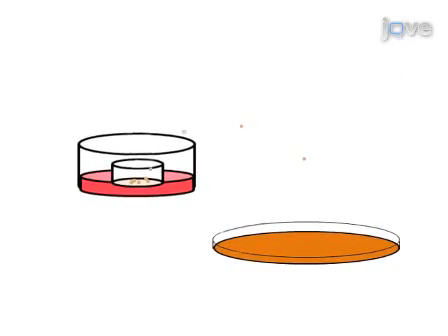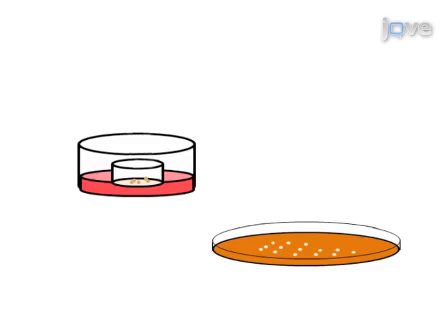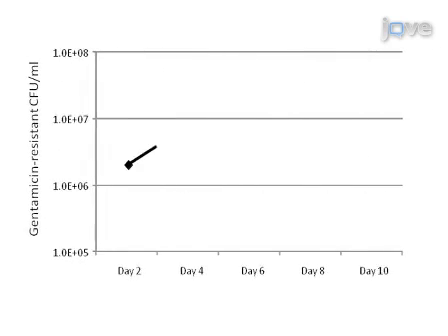Next, the tissues are harvested at the desired time point, and the survival of either total cell-associated or internalized NTHI is determined. Finally, with this method, strain-specific characteristics of NTHI survival within the tissues over time based on viable bacteria counts can be evaluated.